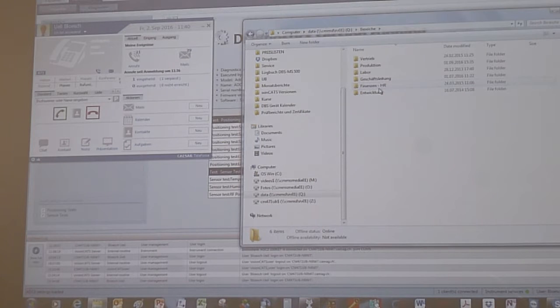For the self-test run, it is not necessary to connect it with the humidity control unit. The humidity control unit is not checked; it's outside of JP. It's salt you bought and mixed by yourself. At the IQ/OQ you test if it is correct, but in the self-test, no.